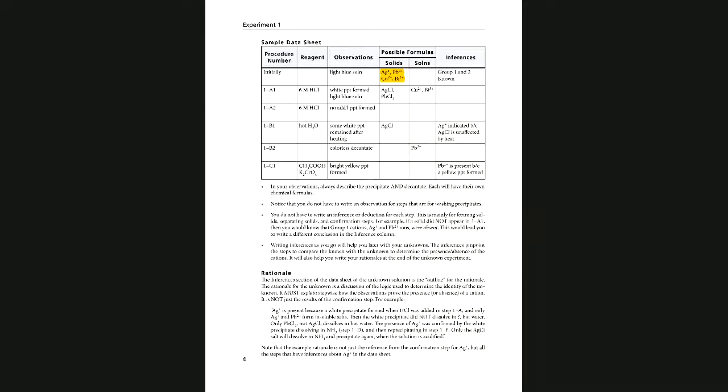Based on the reference book that you have from your lab notebook and the evidences and observation you have for part 1, the last experiments that you saw for the known samples, you come to a conclusion which ions are present and which ions are not present. I try not to give away the answers. I'm going to again show you the flow chart, and that would be a good place to start, because when you look at the procedure you say, well, I don't know where to start.